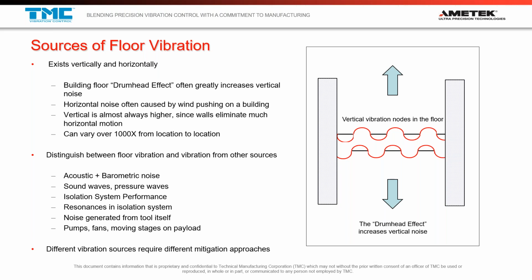A lot of these scanning electron microscopes that are commercially available are going to have their own internal isolation systems. And there might be passive systems based on air. That's the most common one, and it's a 2 hertz isolation system. You can go to the column of any scanning electron microscope and start pushing on it, I wouldn't recommend it, but you can drive it at roughly its resonant frequency of 2 hertz. We also see this type of isolation system using optical tables, where they're resonating at 2 hertz but performing very, very well at higher frequencies.